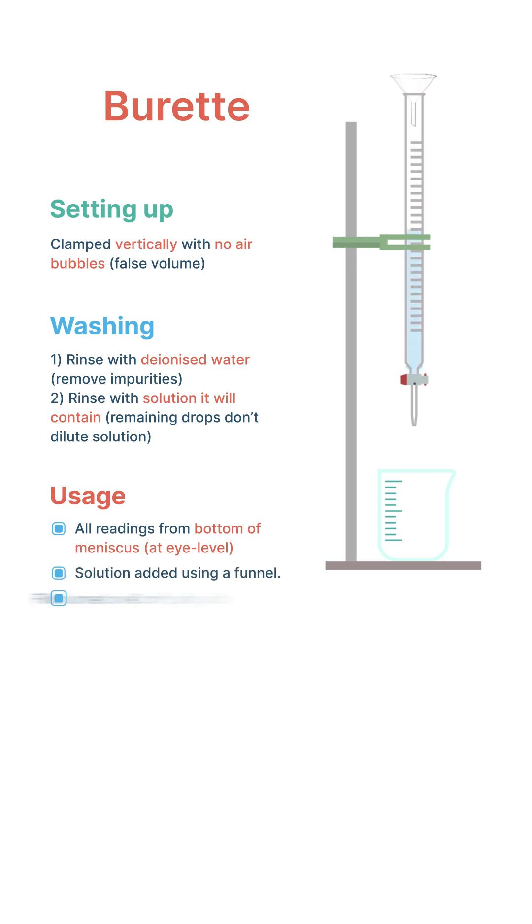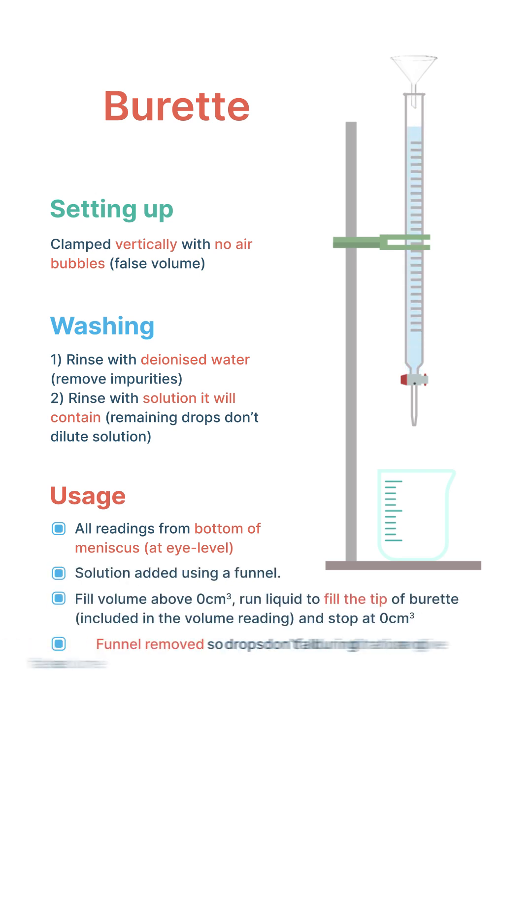We first fill above the zero centimeter cubed mark. The funnel should then be removed so any drops remaining in it don't fall during the titration and give a false volume. Then we open the tap to run the liquid through to fill the tip of the burette, which is also included in the volume reading. We stop when the bottom of the meniscus is at the zero centimeter cubed mark.